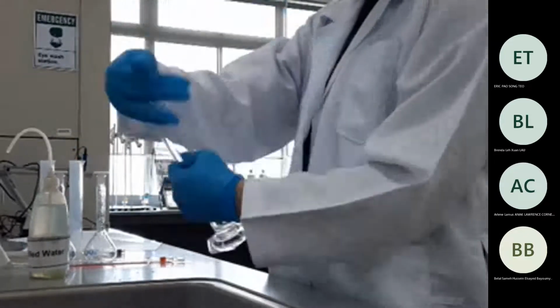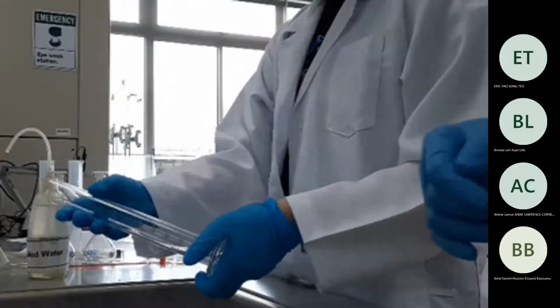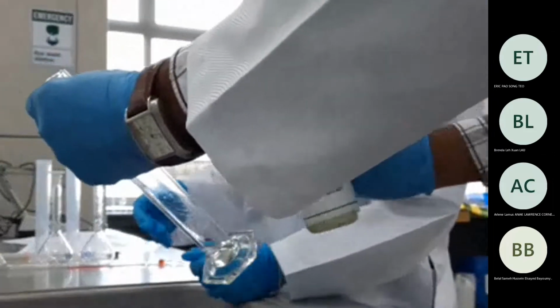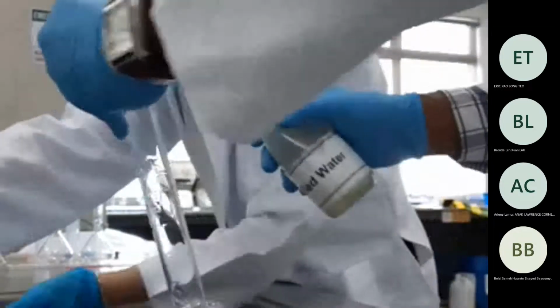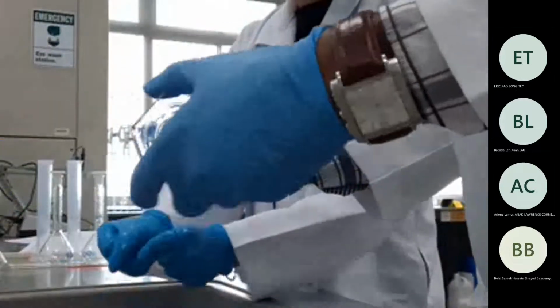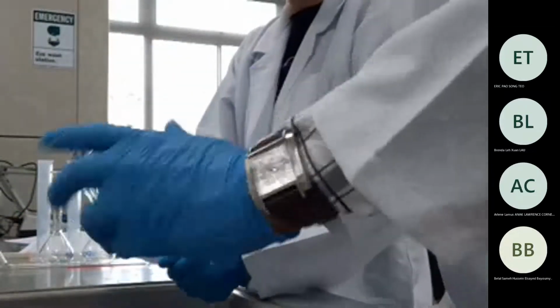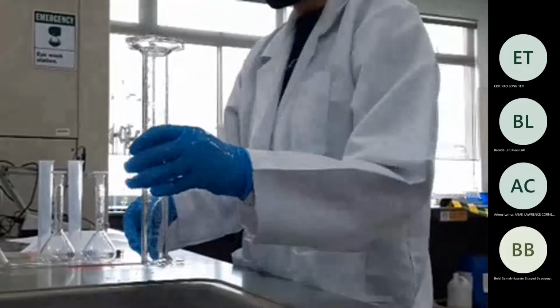Your gloves, can I see? I think you need to clean your gloves first. And then you go like this so that it touches everywhere, and try to rinse out or discard the water as much as possible.